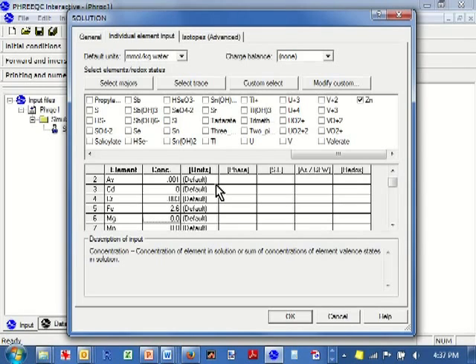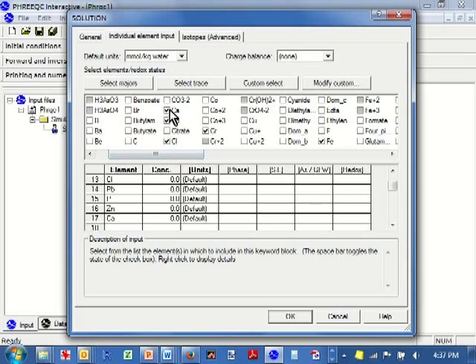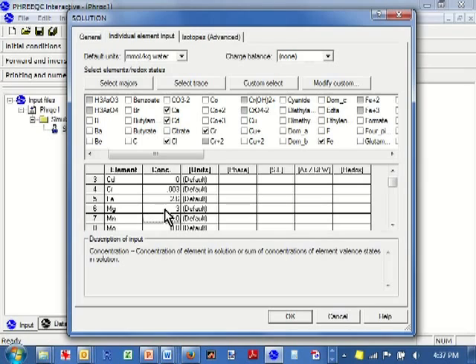Magnesium. Okay, I'm actually going to go back and just pop calcium in as well. The reason I put calcium in is because we've got water hardness as well, and water hardness in calcium carbonate equivalents. Sorry about the mucking around. We'll get this out. So we're just going to give these some nominal values, and I'll explain these as we go. Manganese.